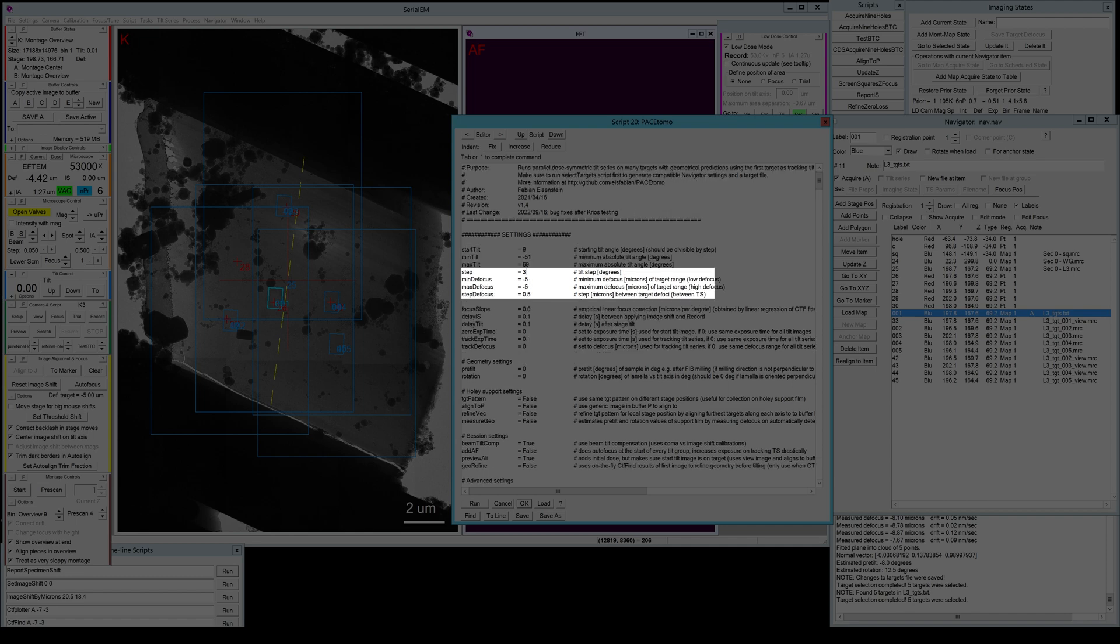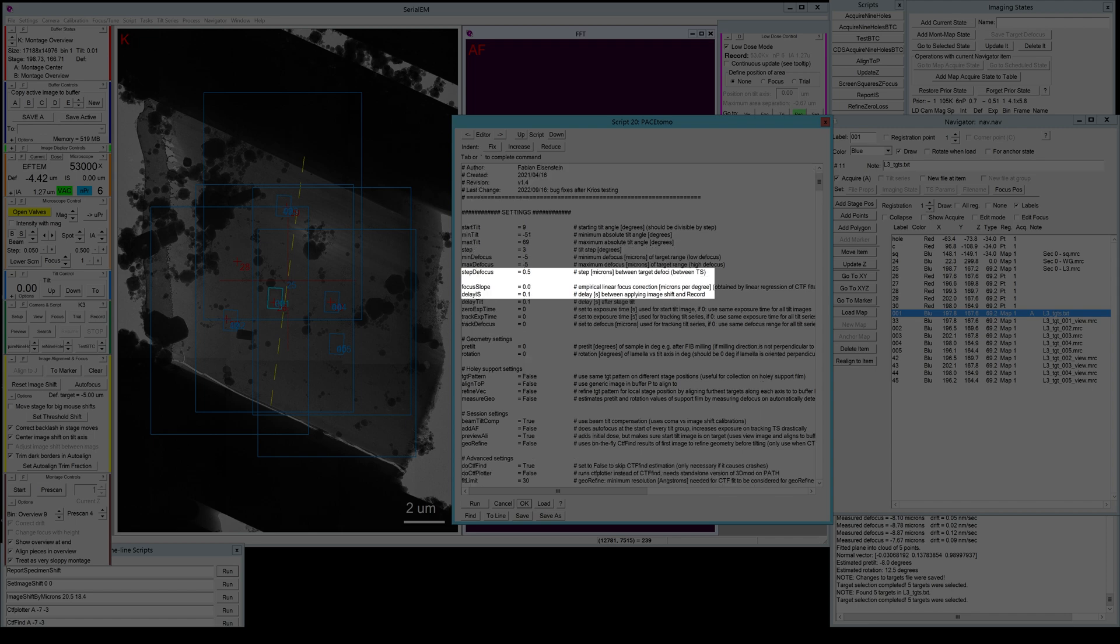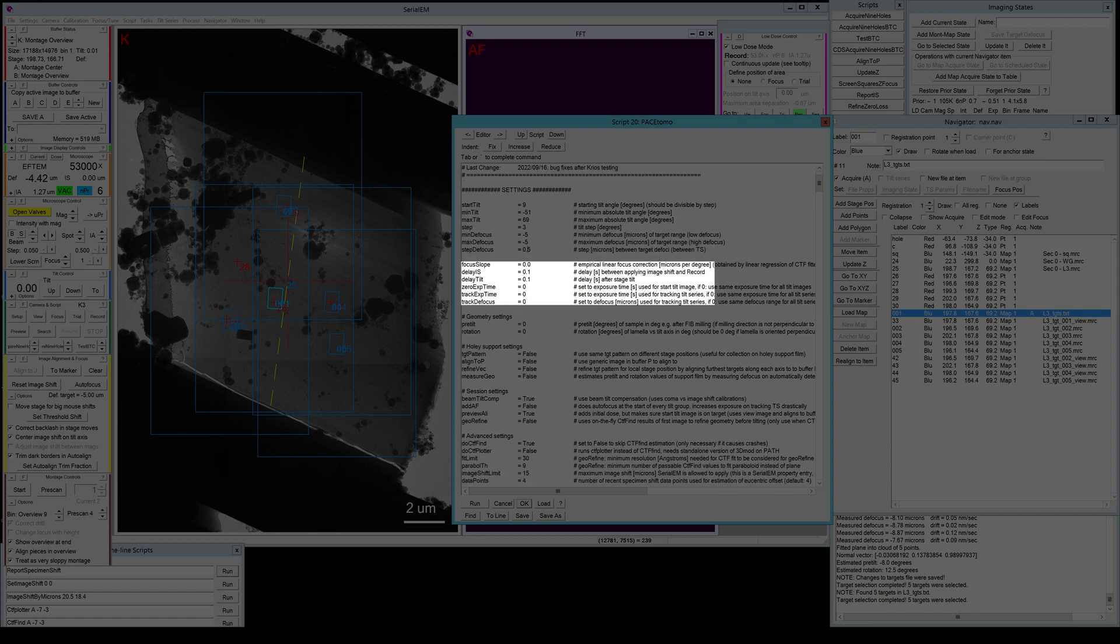Step size is the tilt increment. I'll keep it at three degrees. Minimum and maximum defocus can be arranged if you want to basically increment your defocus with every target. I usually like to keep it the same, so I just keep minimum and maximum defocus at the same number and the defocus or step defocus doesn't matter.